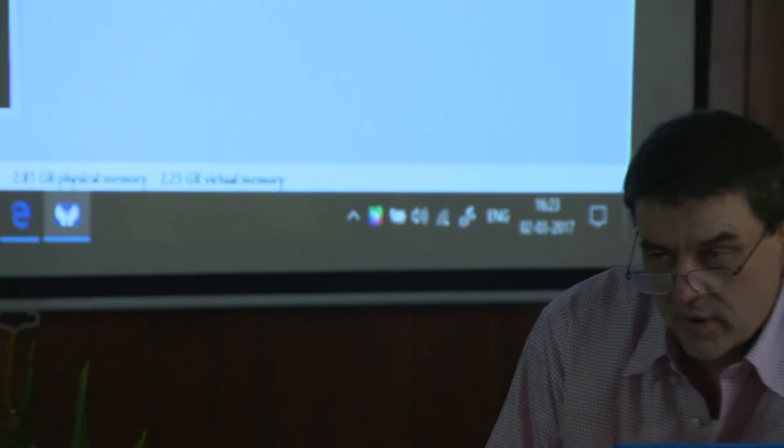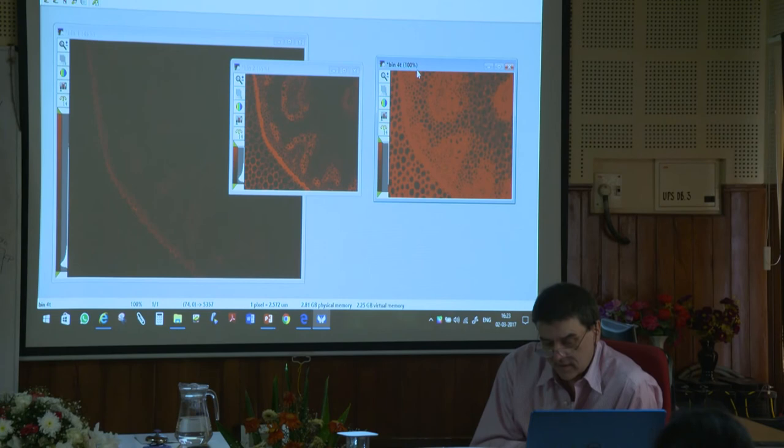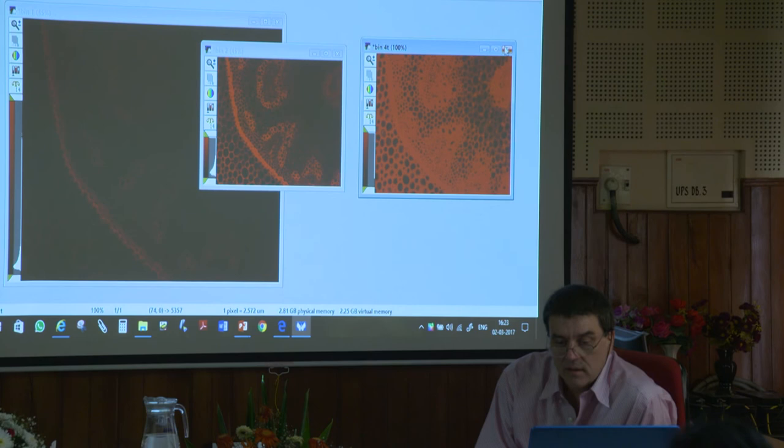Okay. So like we were saying, the idea of binning, it lets you use fewer pixels, bigger pixels, brighter pixels, and then it lets you go faster. So the application you saw the other day, he probably binned by 4 or even higher to get those kind of images.